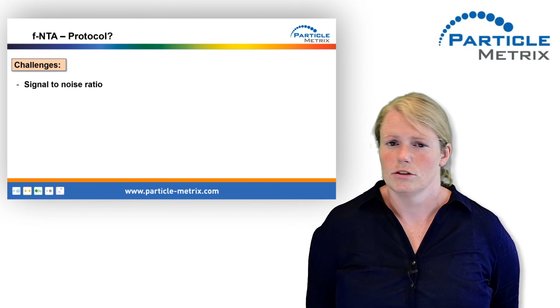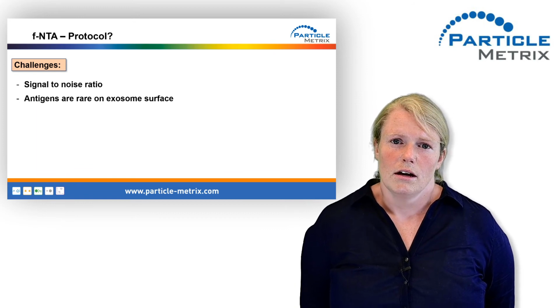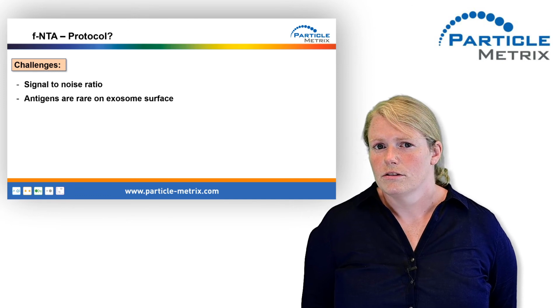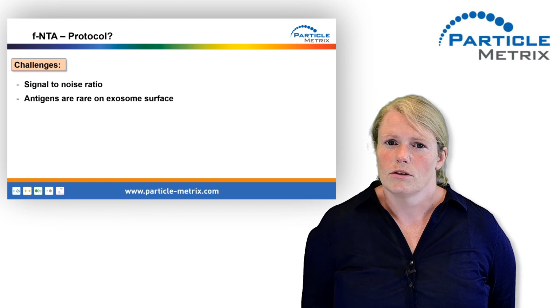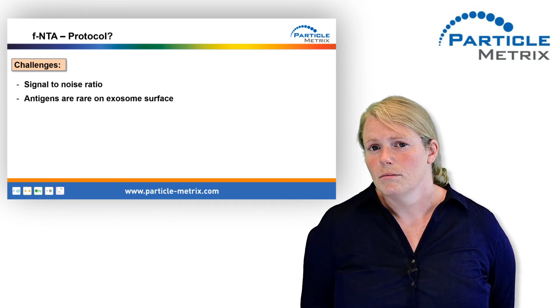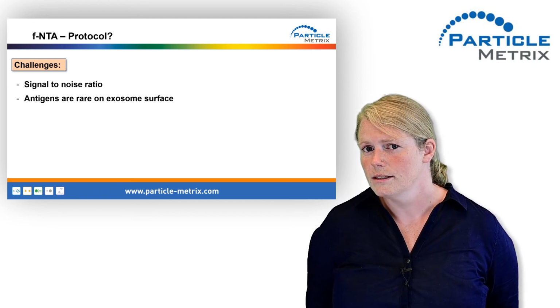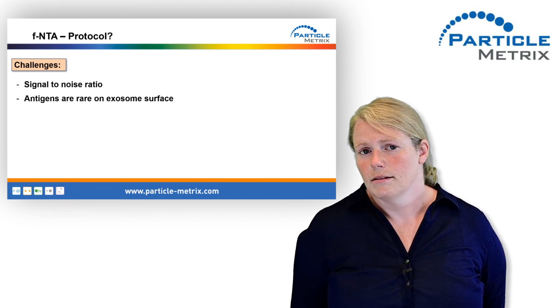Challenge 2, antigens are rare on exosome surface. On a cell you can have tons of antigens, but exosomes are a lot smaller, so you have only some antigens on an exosome surface, so only a limited number of antibodies can bind. Limited numbers of antibodies means limited number of fluorophores, so we can only get a weak signal. So we have to be very sensitive to detect this signal.